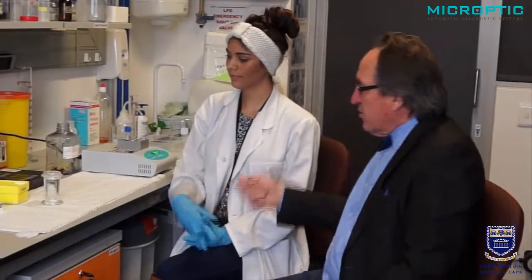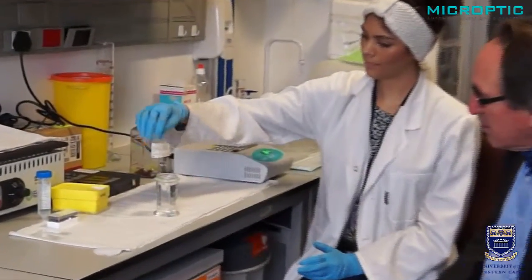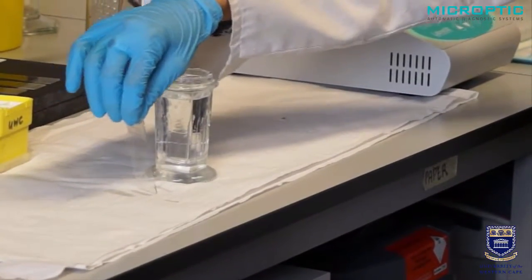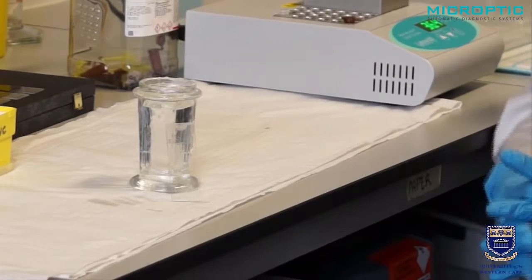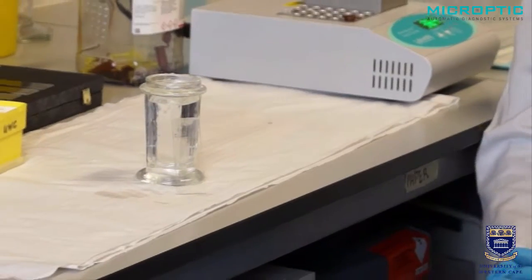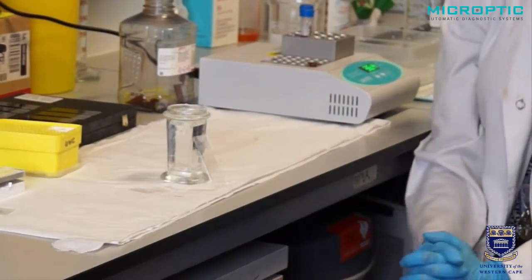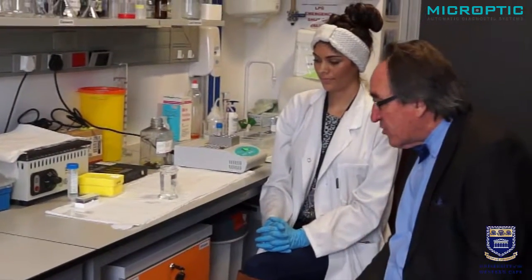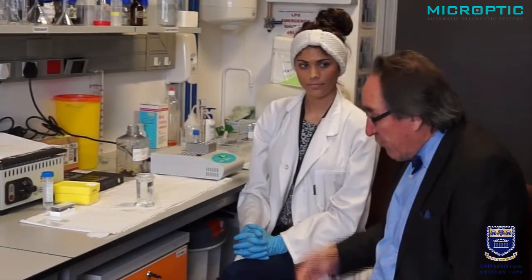Fixation is now complete. We've taken the Copland jar out of the fridge. We remove the slide carefully, drip dry it, and make sure all the alcohol runs off. We put it at about 40 to 60 degrees for it to completely dry. The next part will involve the staining for the acrosome. And also, if there is no acrosome, we need a counter stain as well.